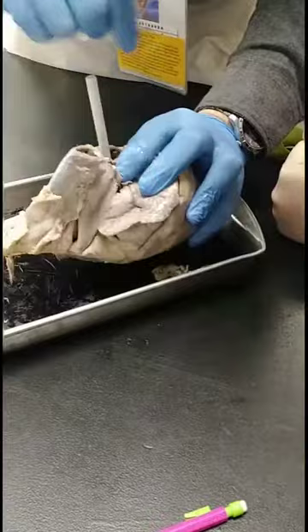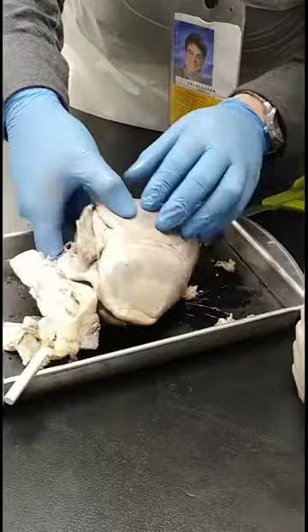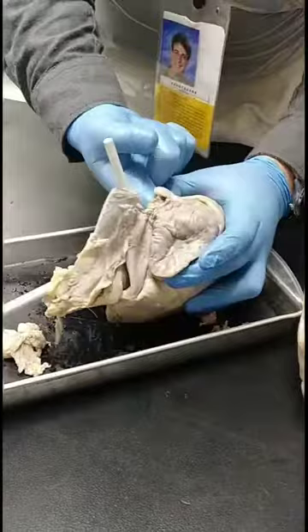This is the atrium right here. What side of the heart is this? This is your front side again, or left side. And you're right, exactly. It's the left atrium. And it'll go down into the left ventricle. This is the auricle.